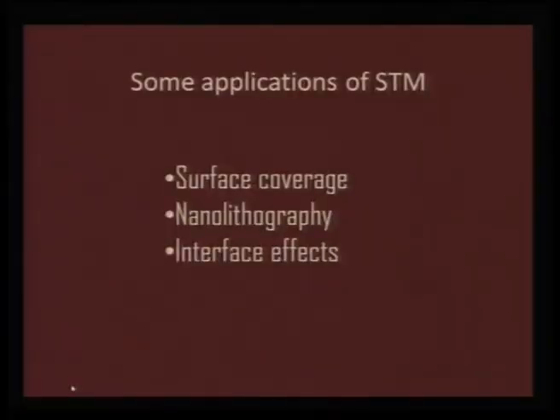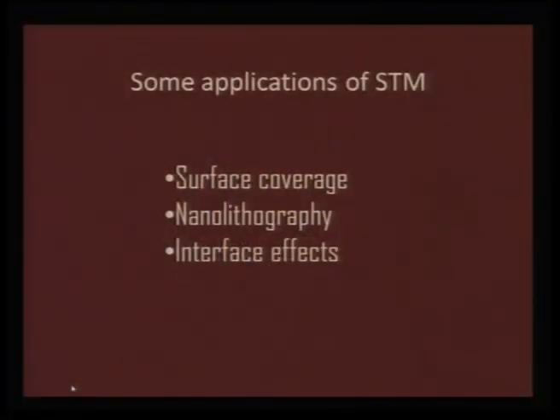I will give you some idea about the applications of STM. Once you probe, what is all that you can look for, and from our own experience, I would like to quote few details. One of the main application of STM is actually in ultra high vacuum environment, where you try to control depositions in atomic level. I have already discussed these slides in module 2 while discussing about molecular beam epitaxy, but today I am going to show some of those results again, but will tell you how to map those depositions. So, the first application is on surface coverage, and another popular area where STM is playing important role is in nanolithography, and also we can look at interface effects. So, we will go by some of the applications of this technique.